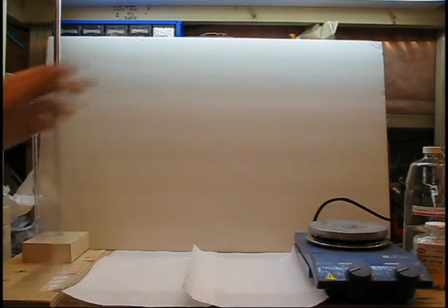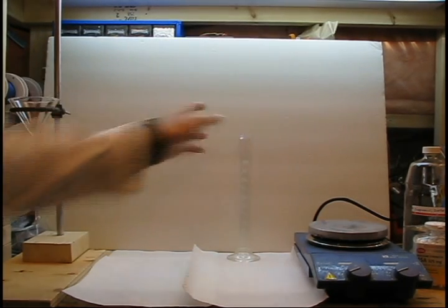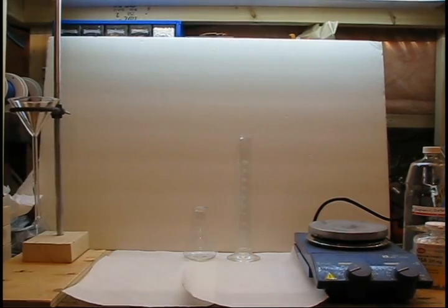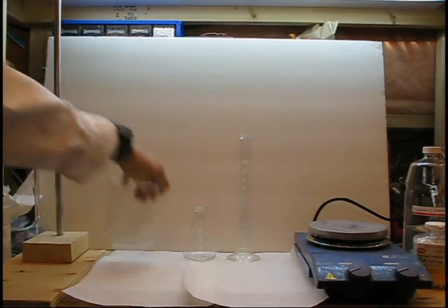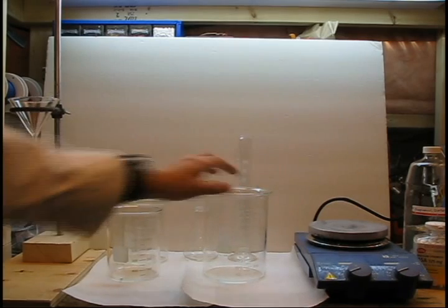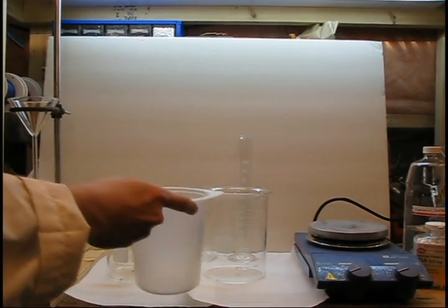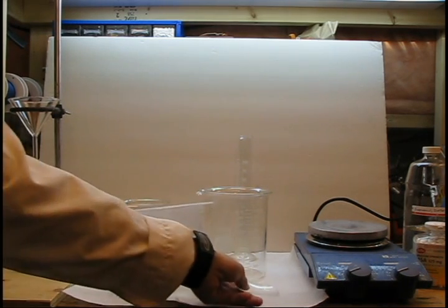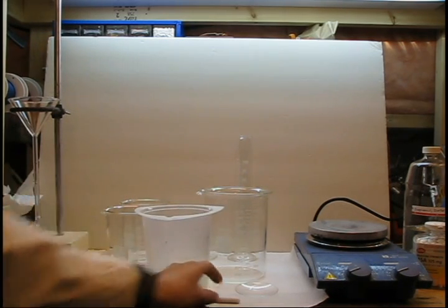For this procedure you will need a 100 milliliter graduated cylinder, a 125 milliliter Erlenmeyer flask, two 600 milliliter beakers, a 1 liter beaker or large container for an ice bath, another container for cooling distilled water, a glass stir rod, a watch glass, a Teflon stir bar, and either a filter funnel with ring clamp or a vacuum filtration flask and Buchner funnel.